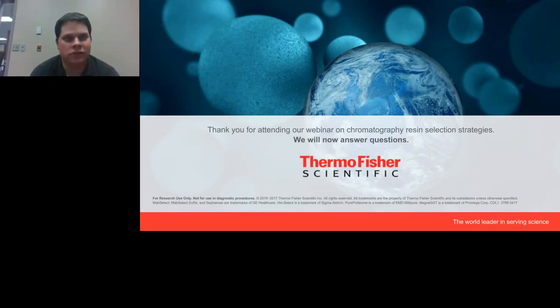I could postulate why. I don't know exactly for sure, but since the magnetic agarose bead has a smaller diameter, it's 10 to 40 microns in size compared to agarose, which is anywhere from 50 to 150 microns, you have more beads in the same volume. So a 100 microliter settled volume of magnetic agarose is going to have more beads than a 100 microliter settled volume of traditional agarose. So potentially you'd have a higher cumulative surface for your target to bind to.